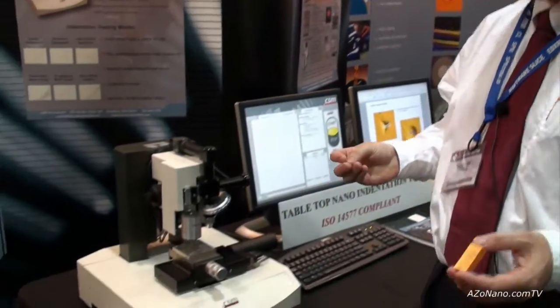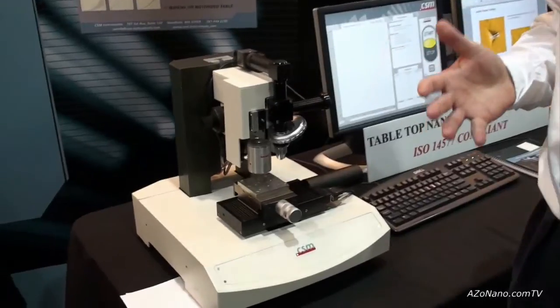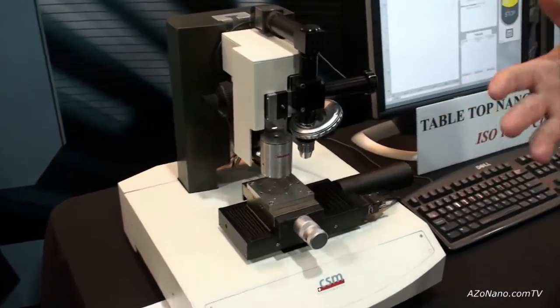Thank you very much Cameron. So, this machine, well as most people know, nano indentation testers are very large, bulky, expensive pieces of equipment.